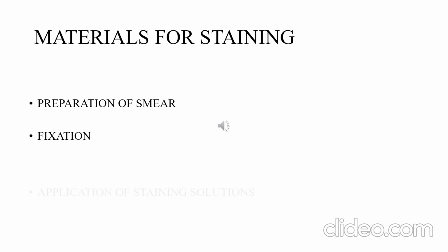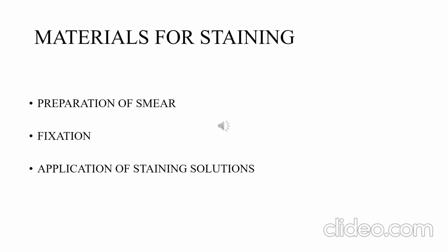The next step is fixation. Generally, the fixation is done as heat fixation in microbiological cases, very rarely with methanol. The third step is the application of the staining solution.